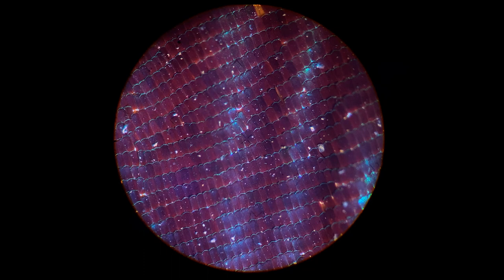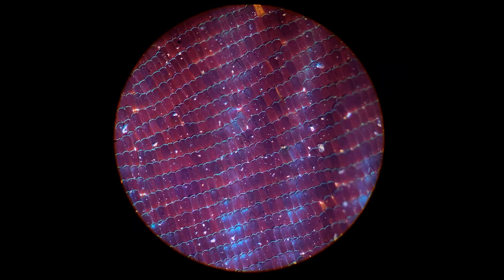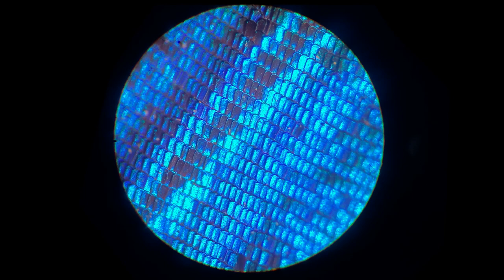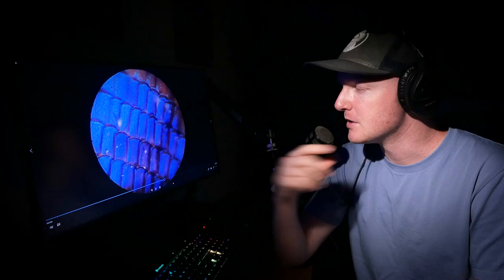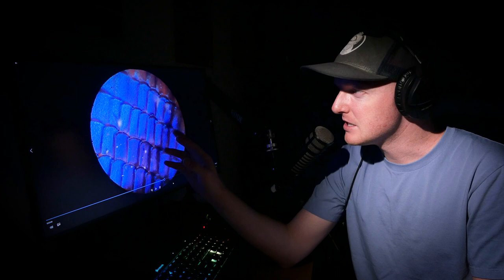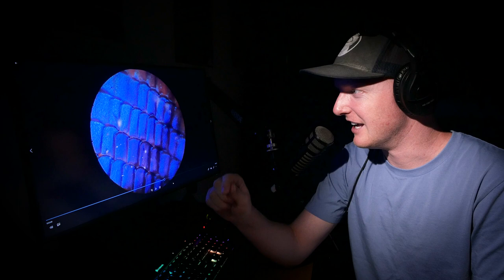Here's a spot that's a bit more blue. Oh and even closer. It looks like sparkly shingles on a roof or something like that. So these ones definitely not as translucent as the other ones. I think I like this one a little bit better. And it gets me pretty excited to check out that sunset moth because it's all different colors. Let's see what that looks like.